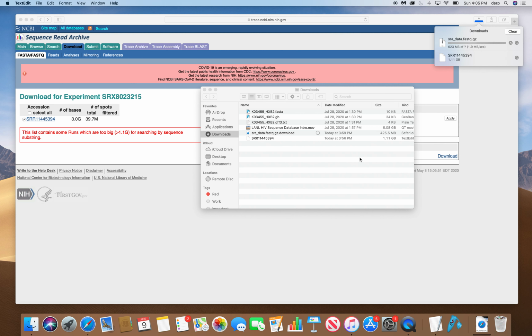So this is still going. It is maybe like 25% done, and I'm just going off of this SRR file size because, again, this is compressed. So I'm thinking that this may be a couple of gigs, and it just needs to go for a little bit. So we are going to pause, I think, let this finish, and we will start up shortly. So stay tuned.